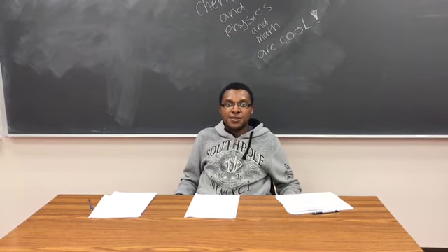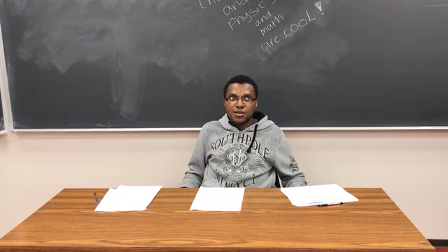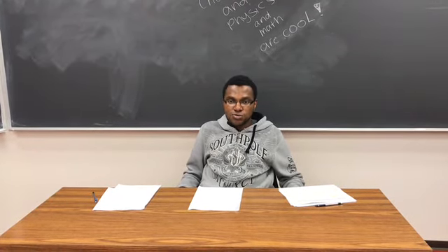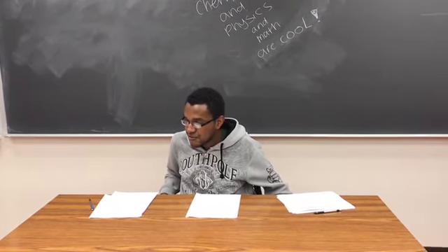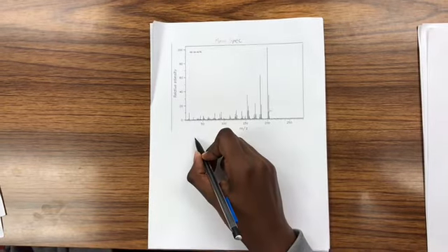My name is Oliver Buffole, and I'll be looking at mass spec, IR, carbon-13 NMR, and proton NMR to find the 3D structure of my molecule, which is 4-amino-5-chloro-2-methoxybenzoic acid. We're going to start with analyzing the mass spec.